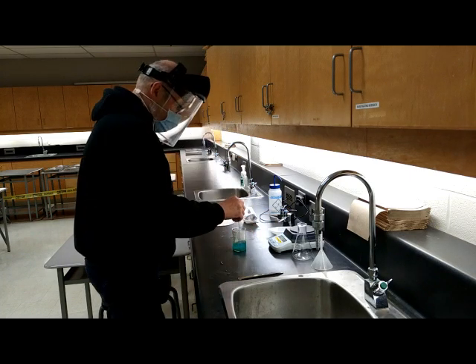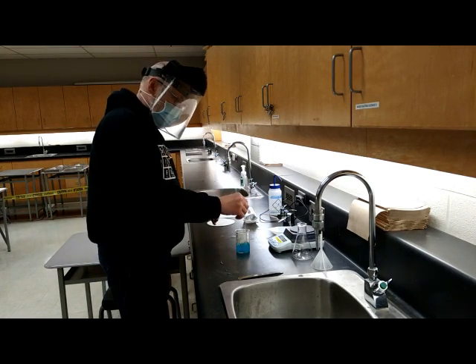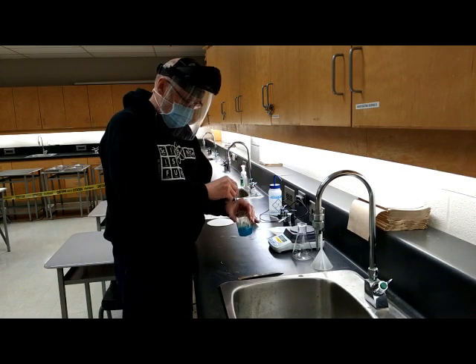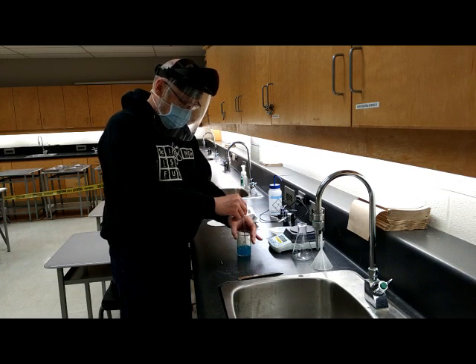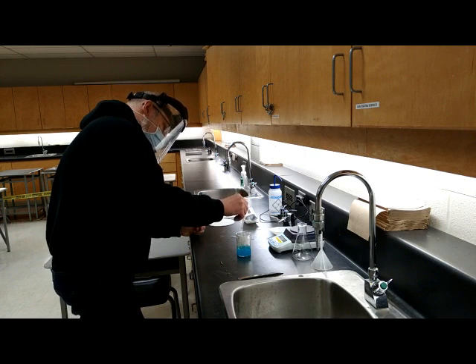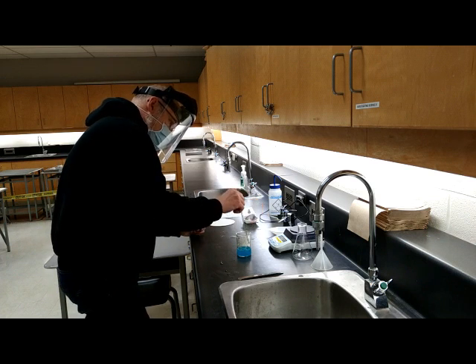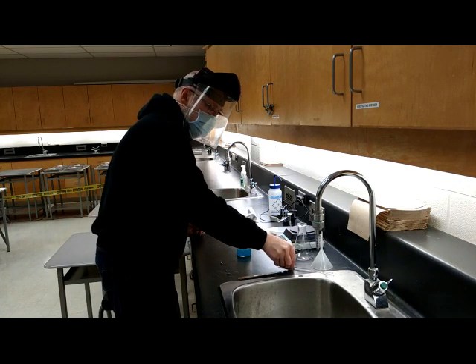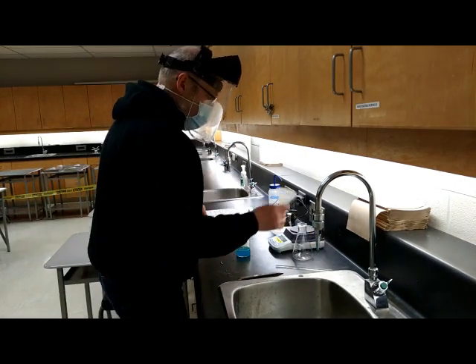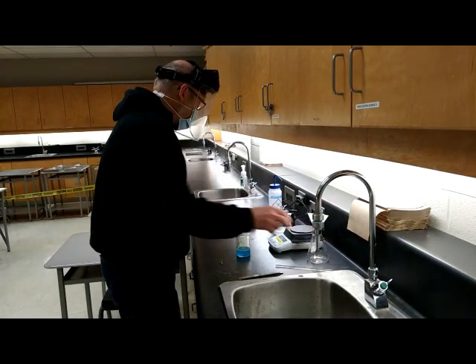And stir that around. You'll notice that depending on how much is dissolved, it either turns a nice green color or a nice blue color. And so once that's dissolved, as it is now, that's going to be our excess solution, okay? So the next thing then is that I'm going to have to carry out the chemical reaction.